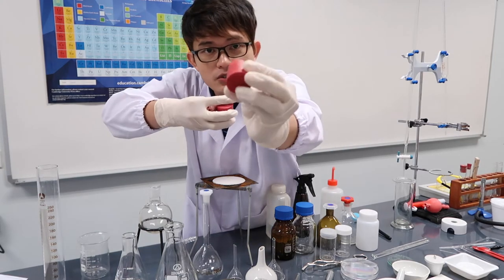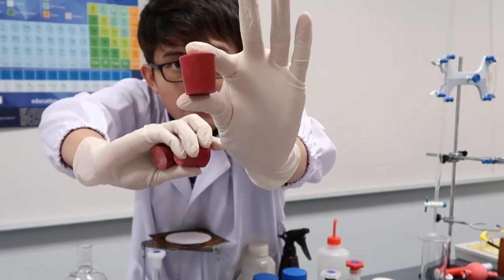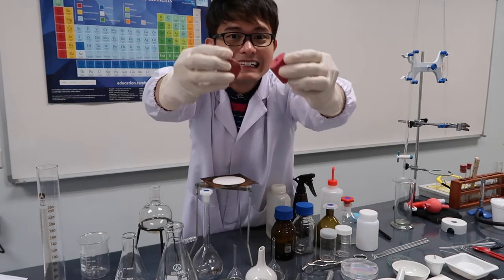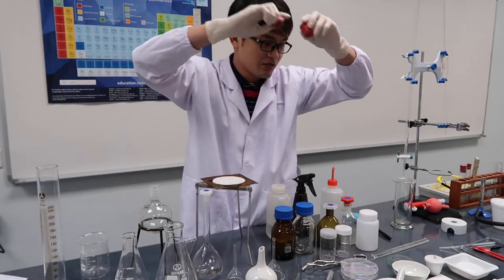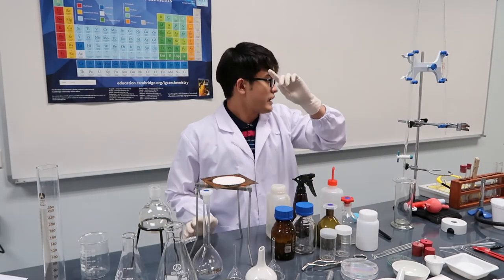Here are rubber stoppers. This one has no hole, this one has one hole, and this one has a double hole — two holes. So those are the rubber stoppers.